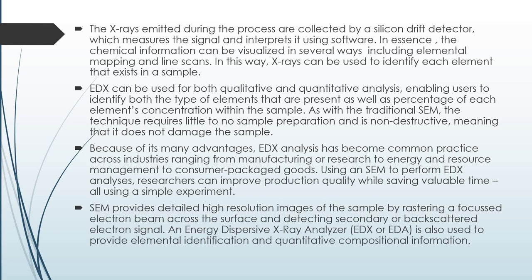And as with traditional SEM, the technique requires little to no sample preparation and is non-destructive, meaning that it doesn't damage the sample. Because of its many advantages, EDX analysis has become common practice across industries ranging from manufacturing or research to energy and resource management to consumer packaged goods.